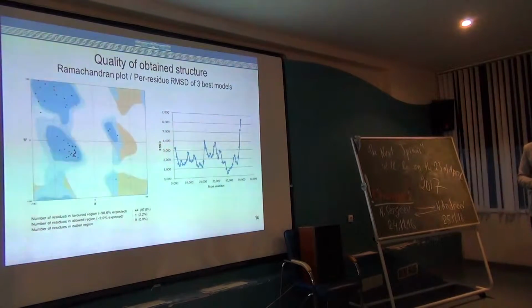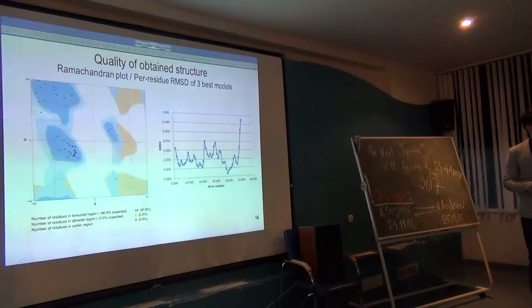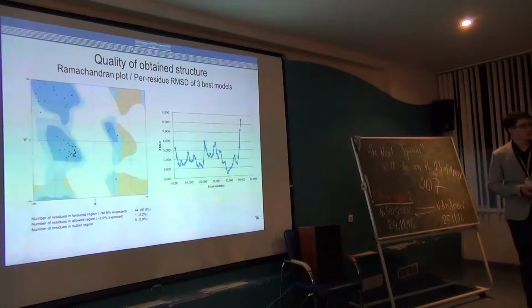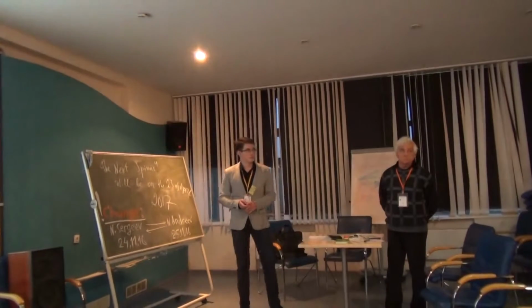I was wondering, how many NOEs per residue did you have? I have 500 NOEs, and that is per 40 residues in insulin, right? Something like that. Not only between alpha protons, beta, and it is quite big. I wonder also how it compares with the human structure.